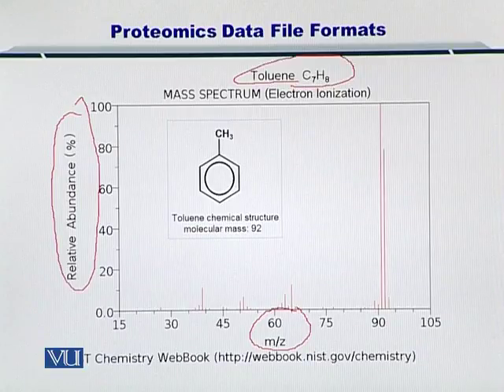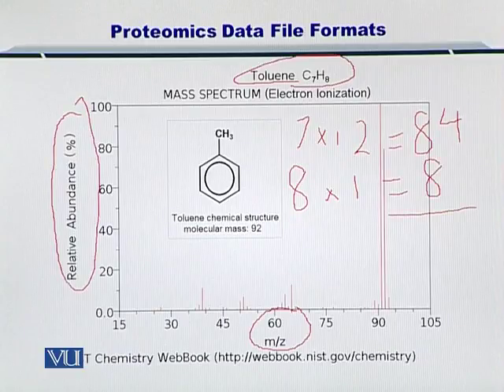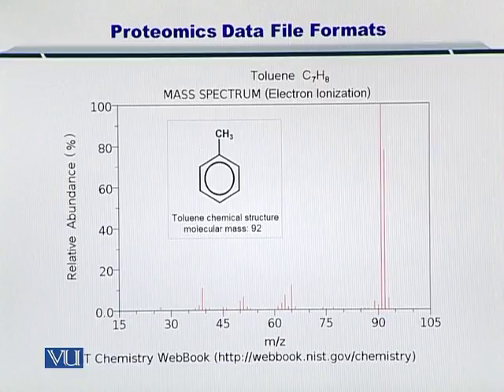So in this case, the molecular weight measured by the mass spectrometer will be 7 atoms of carbon multiplied by 12, that's equal to 84. 8 atoms of hydrogen multiplied by 1, that is equal to 8. So you sum them up and you should get a molecular weight that is 92. So you get some peaks here that are very close to 90 or 92.